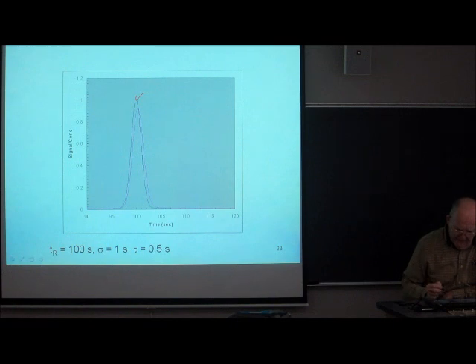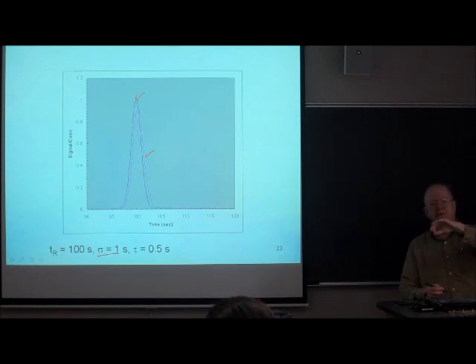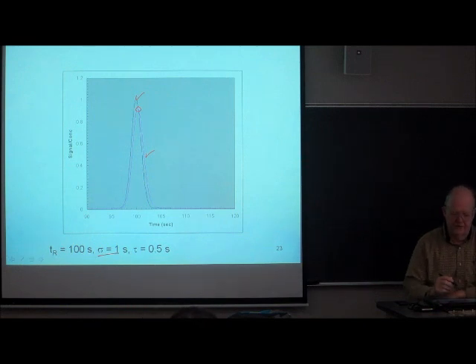This is with a time constant of 0, and this is with a time constant of 1/2 of a second. The sigma of the underlying Gaussian is 1 second. So even if the time constant of the detector is a smaller number of units of time than the width of the peak in sigma units in time, there is some influence, and this peak maximum is diminished.